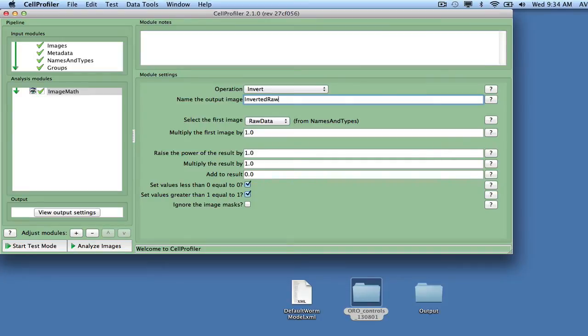Most image processing algorithms operate on grayscale data, so the next thing we will do is convert the inverted color image into a grayscale image in two different ways.